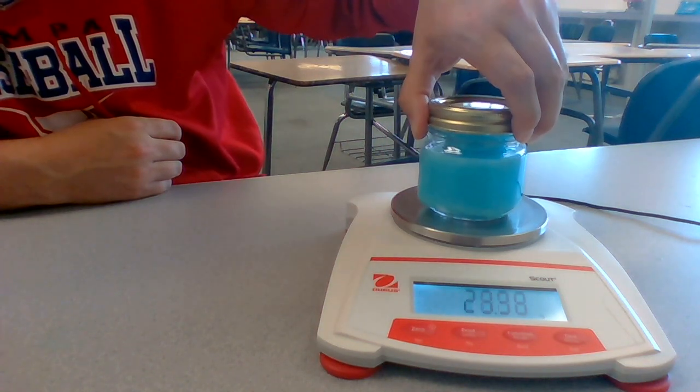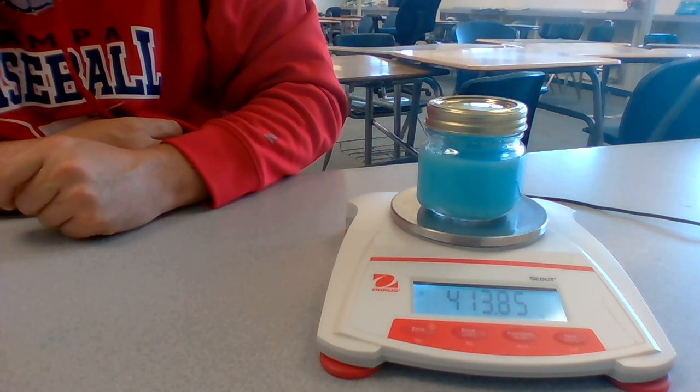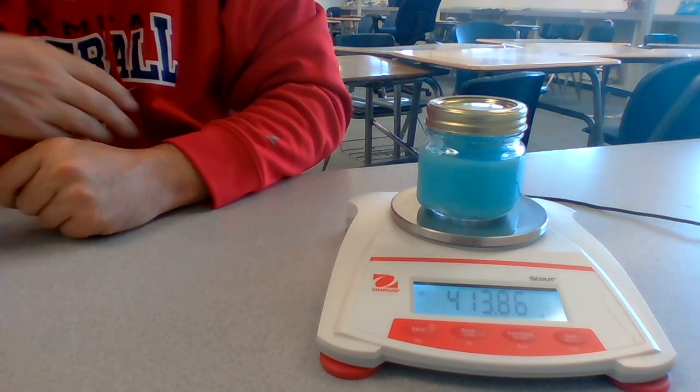All right, I'm going to go ahead and weigh this again. And look at that — the mass of this is 413.86 grams.